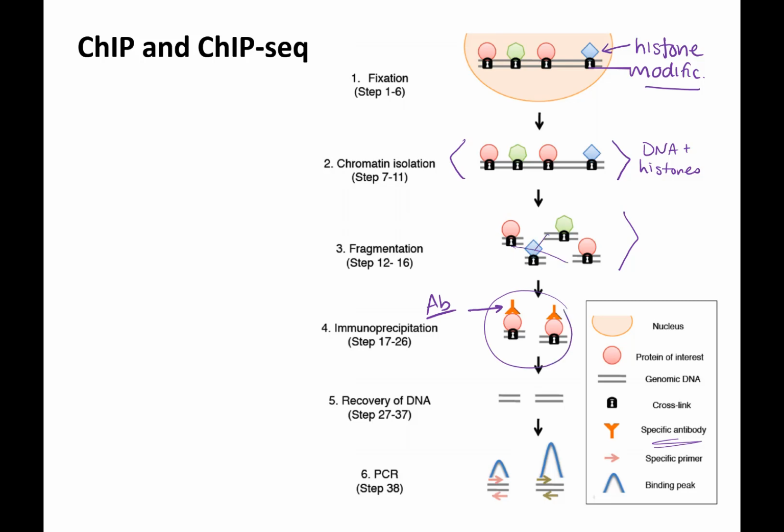I want you to see you lose all these other ones that are not with that modification of interest. You get rid of the proteins so that we can analyze the DNA, and this is showing PCR or sequencing so that you can figure out what DNA you're looking at.